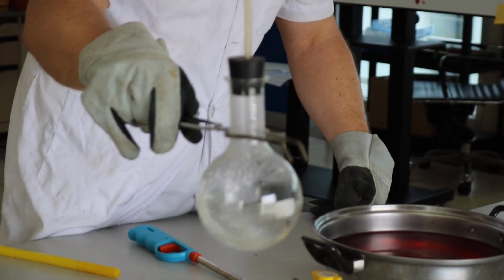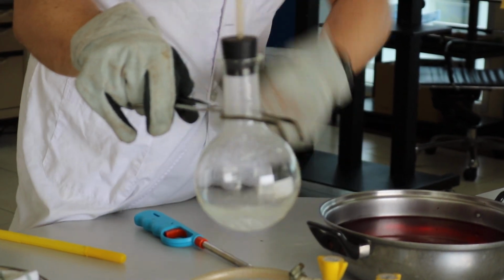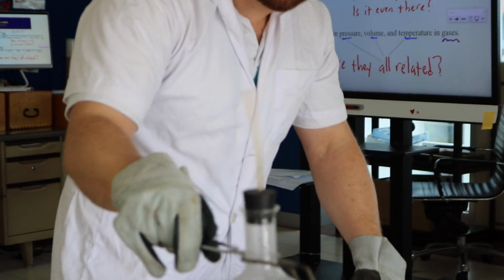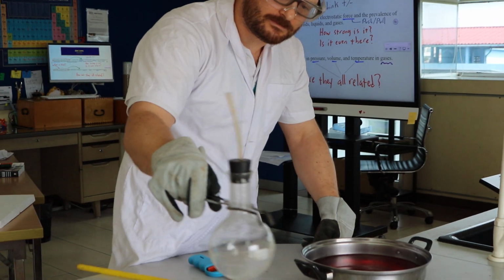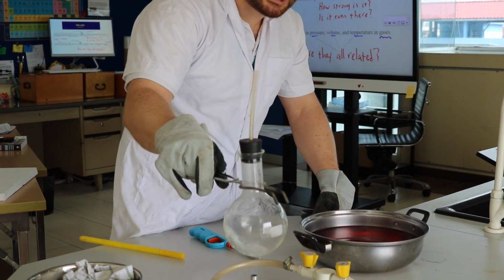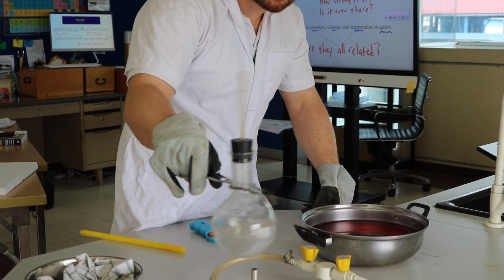Okay, you see there's bubbles forming in the bottom. We have a boiling action going on. Check out at the top. It's steaming. Okay, what changes are going on in this process?